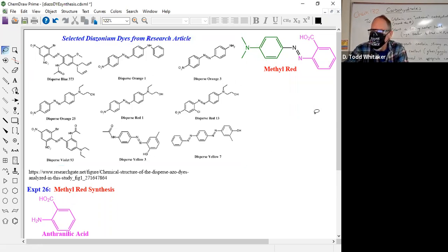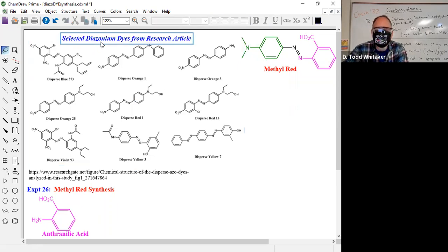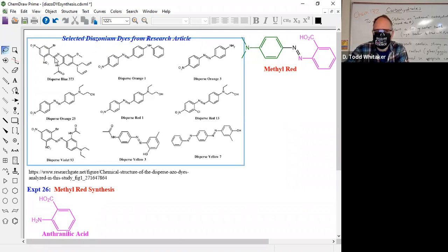Diazonium. What does the dye mean? We got a lot of dyes. What does the DI right there mean? Two. What does azo mean? Always. What element are you talking about when you see azo? No, the element is nitrogen. Every one of these dyes has two nitrogens in the middle. Diazonium, diazonium, diazonium. Good.